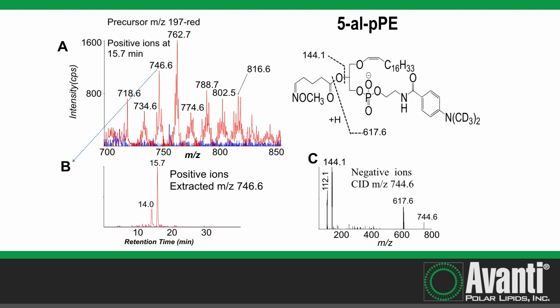Now, the last example of one of the new peaks was this later peak, which was coming off. Once again, here's the red peak. There's lots of ions in this region, around 15 minutes, lots of ions. There are lots of different products coming off. And that's the story of free radical oxidation. It makes lots of products. So you sequentially go and investigate each one of these. We'll just do one of them.